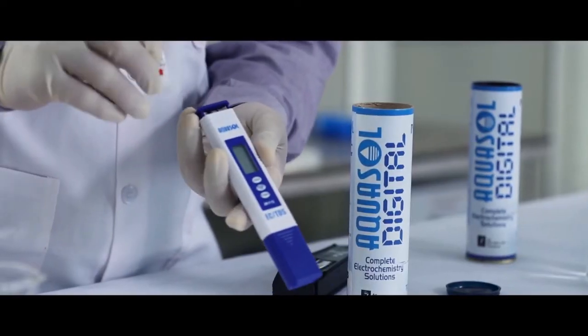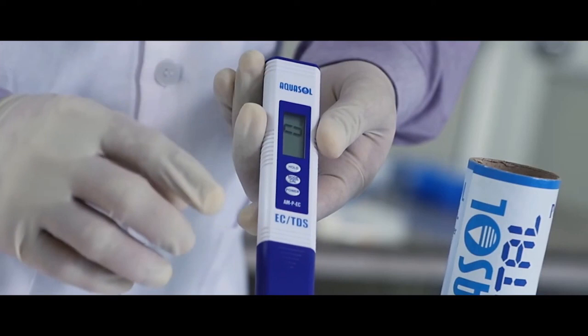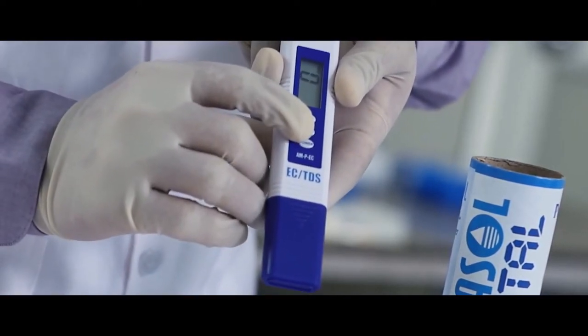Pull out the battery paper and press the battery cap to start. Press the mode key to change mode to conductivity.